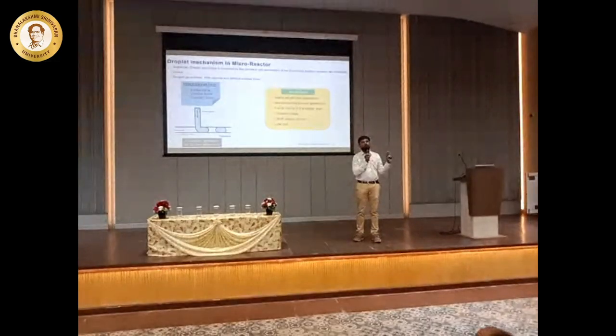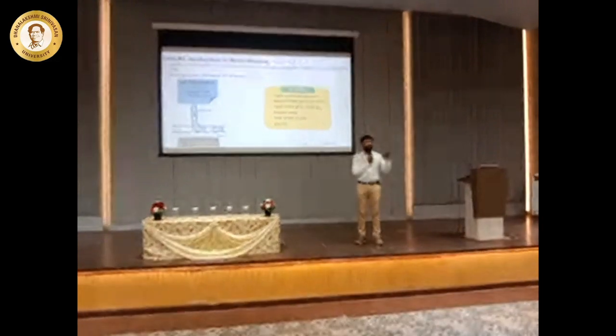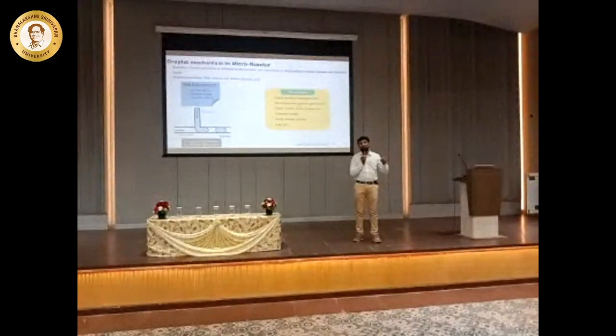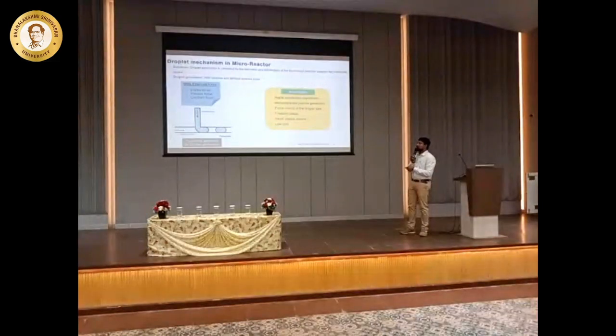Very simple. We don't want to make it complicated. I want to make a micro droplet beaker. How I can make it is that you have an oil and you start infusing this aqueous solution, and depending on the flow rate, you can change the droplet sizes. So this will make a highly parallelized experiment, and you can create monodispersed particle sizes, and it can facilitate control over the droplet size, and we also have a small sample volume.